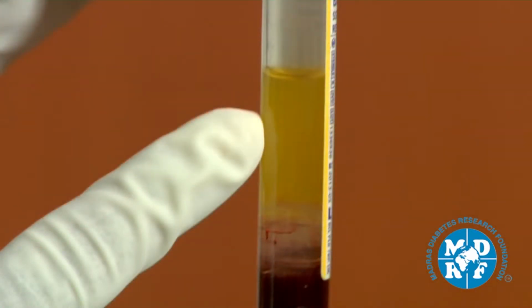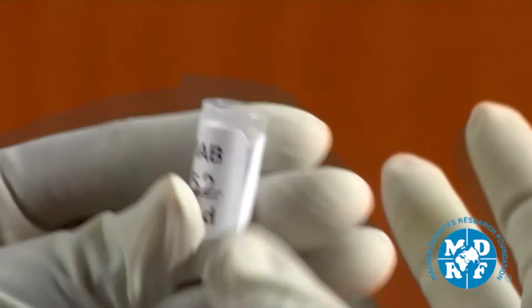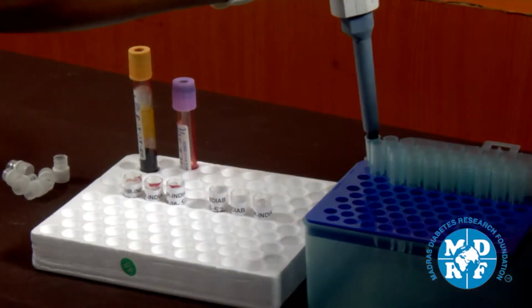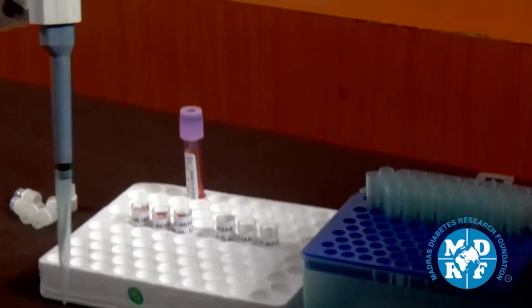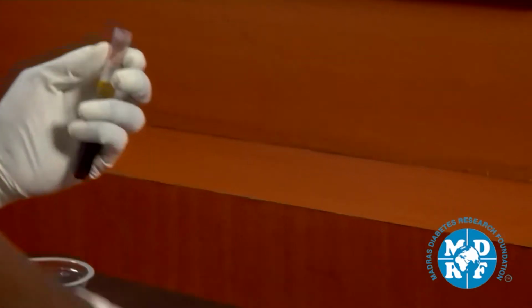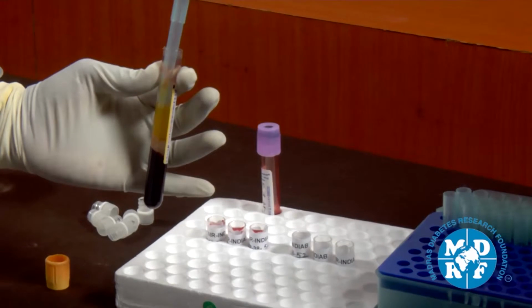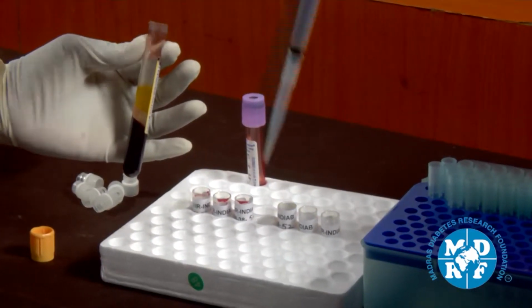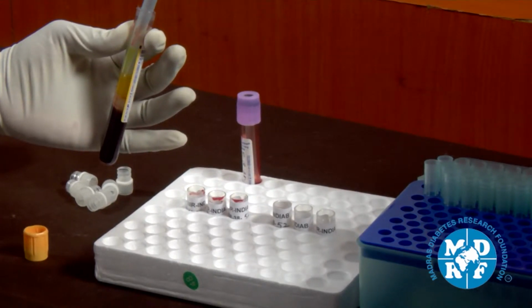The serum is now ready to be transferred to cryo vials. Label the cryo vials and keep them uncapped for sample transfer. The serum is then transferred to 3 1.2 ml cryo vials. The transferring of the serum samples into the cryo vials should be done with the help of micropipettes. About 0.5 ml of the serum samples should be pipetted and transferred to each of the 3 cryo vials.